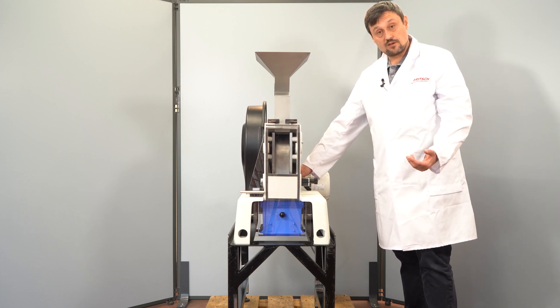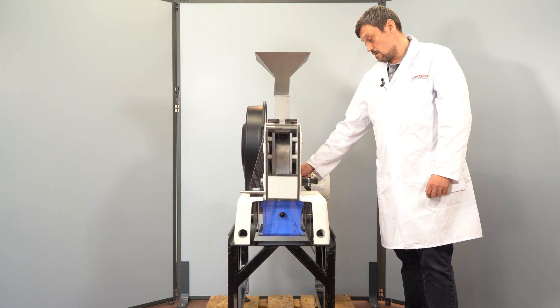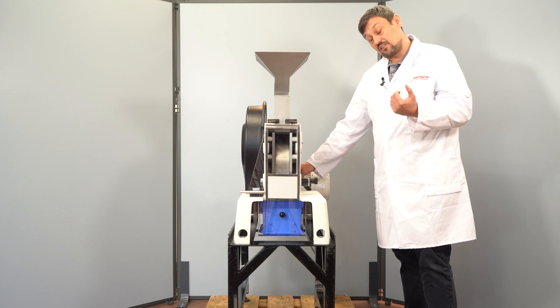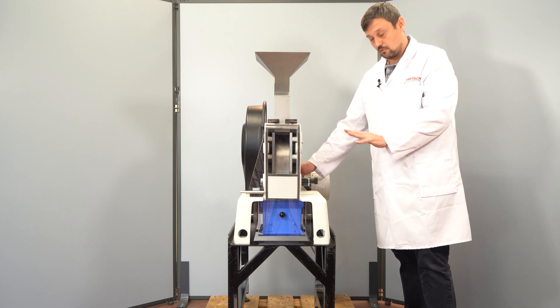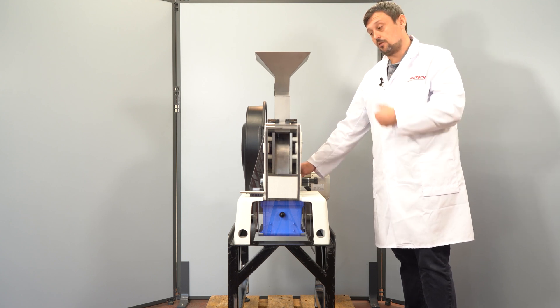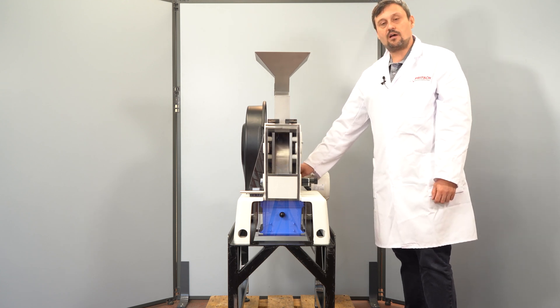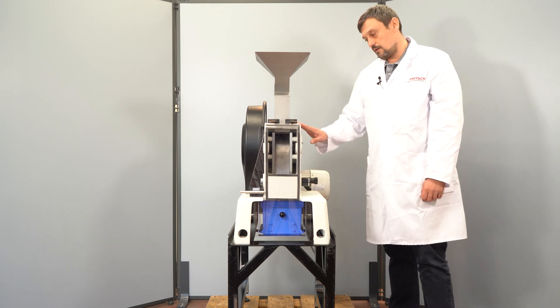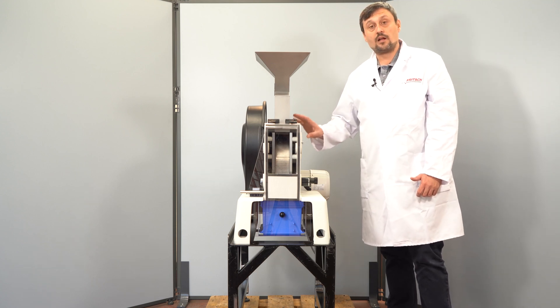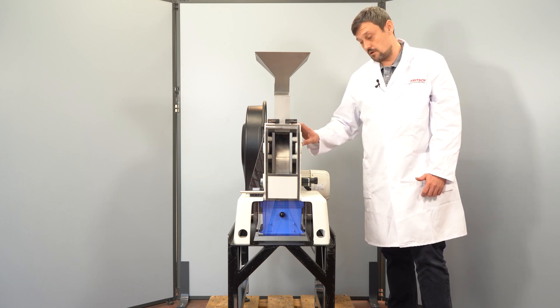After three seconds you can put in the sample. Please make sure you never put the sample in without the mill running. Wait until you no longer hear any crashing or grinding sounds, then let the mill run empty for at least three seconds before stopping. Otherwise you risk that particles become clamped between the moving jaw and the fixed jaw, and you will not recover 100% of the sample.